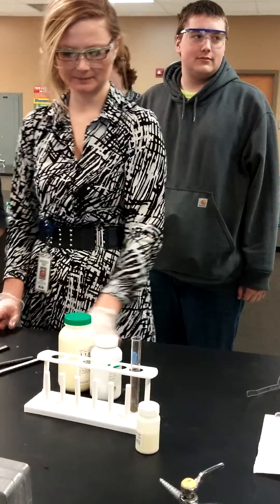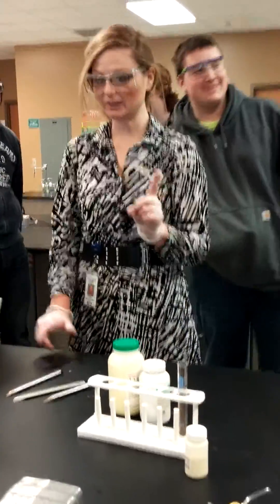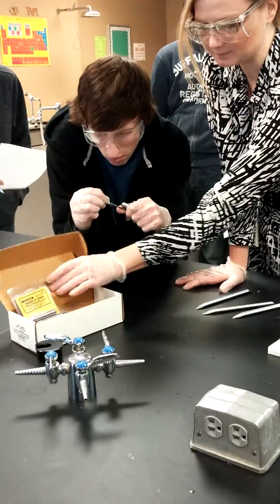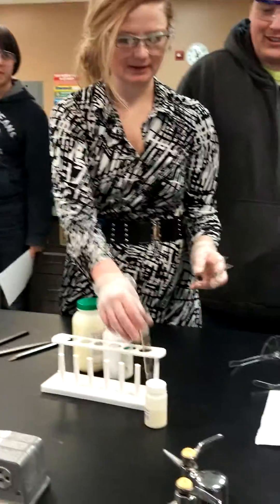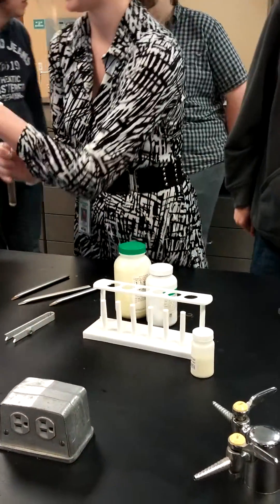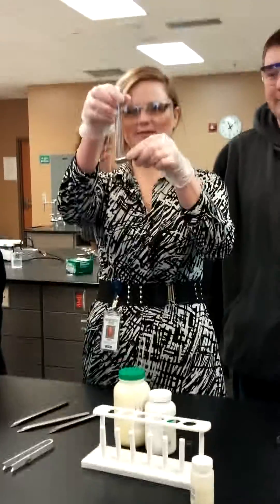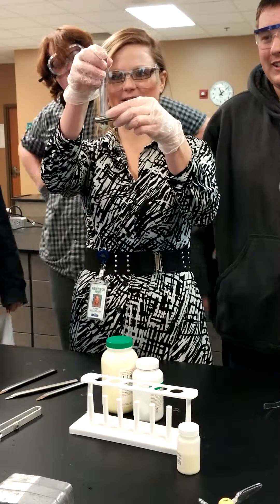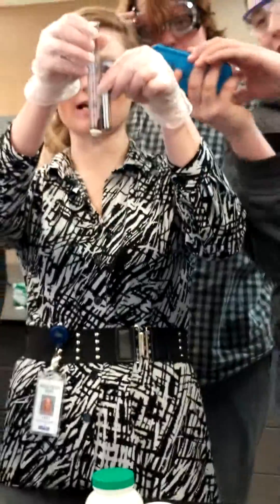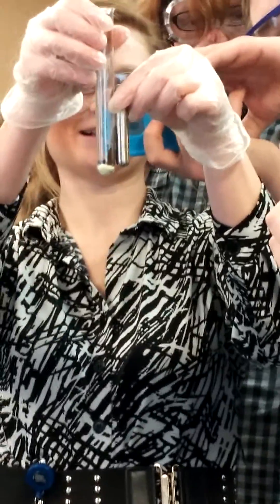Does anyone need a picture of what it is? Now, the only other thing I was going to show you to write down for the evidence — remember the whole magnet thing I wanted to show you? That's what I wanted to show you. So if you want a picture of that, this is evidence showing the reactant iron is magnetic.